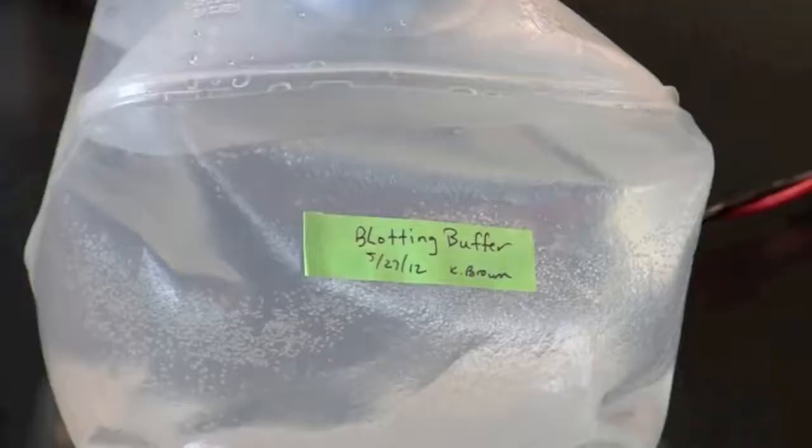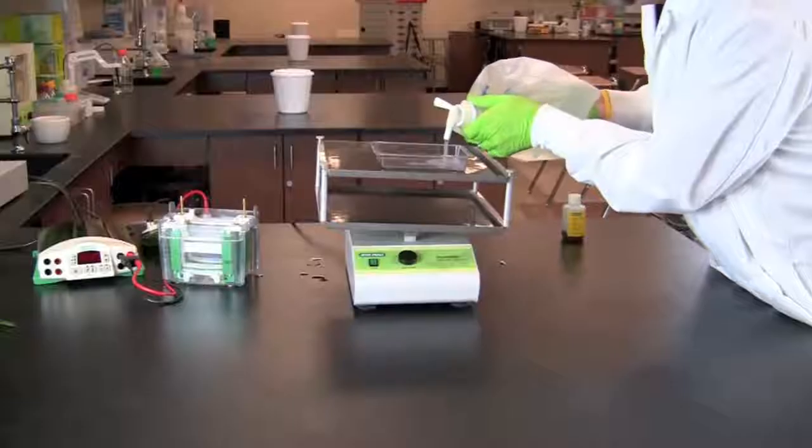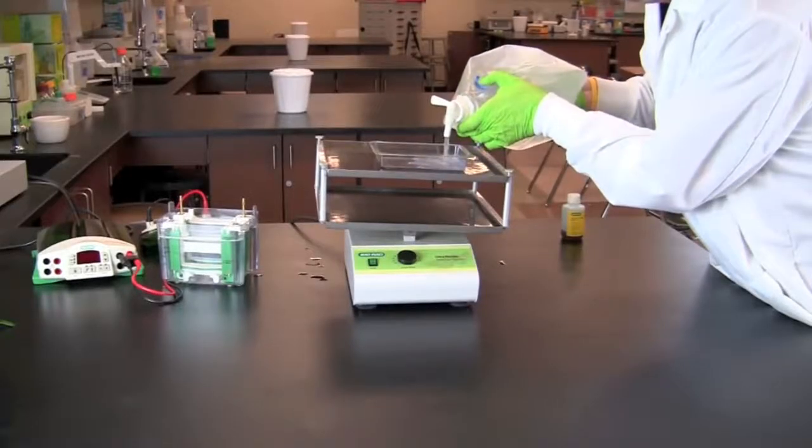First fill a tray with blotting buffer. You will be using this buffer to equilibrate your gel prior to starting the western blot.